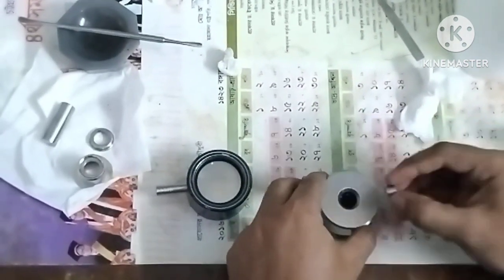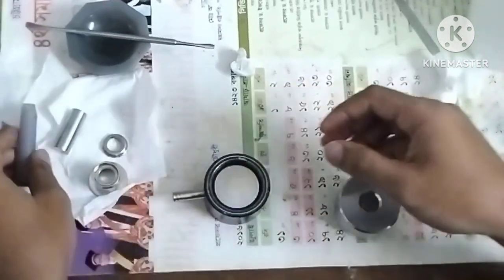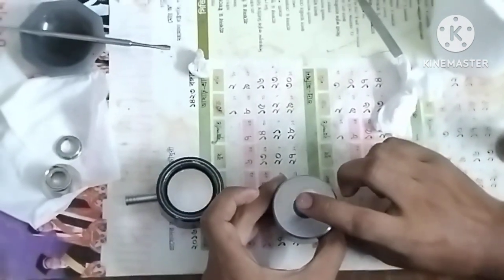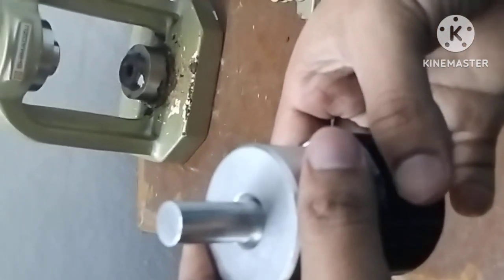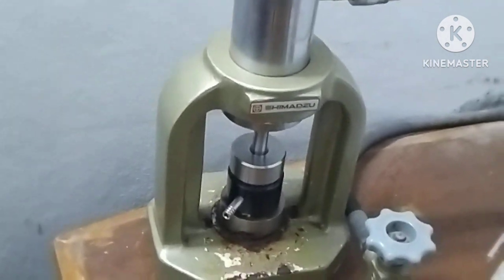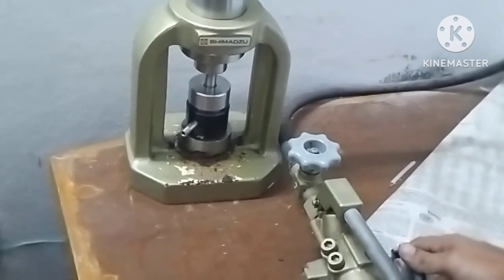Then we will keep the small steel component in the upper part, and we will press the steel rod to transfer it into the internal portion, and we will set up the pressure machine. When we place it in the pressure machine and set it up properly, we will use the handle to apply pressure.